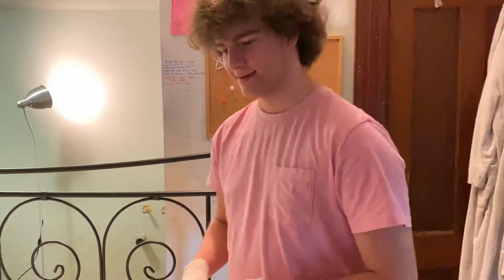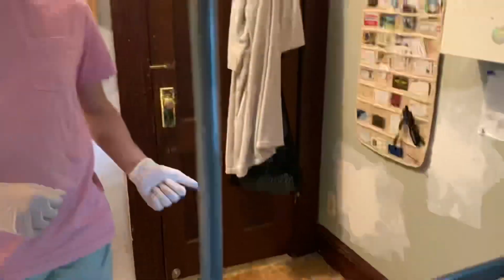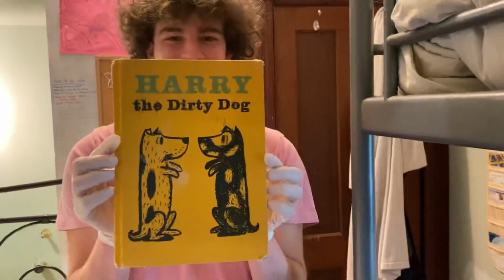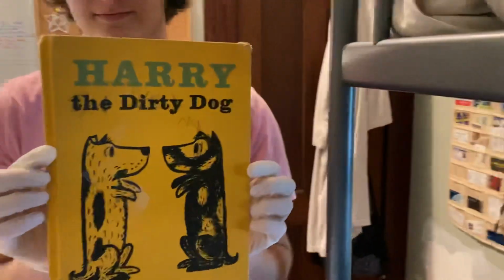Cool. Okay, so we're going to do a couple more tests. For fun, we're going to do a sample on the floor, which is fairly dusty. Very. And we're going to do some samples on this book. Hold the book up. On this book, Harry the Dirty Dog. Because we know this book has really high lead levels, and we're going to find out how much comes off when you touch it.